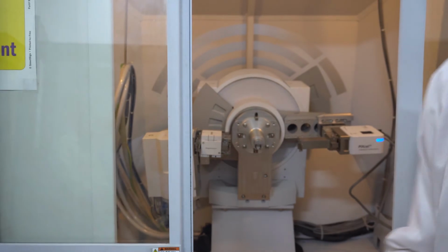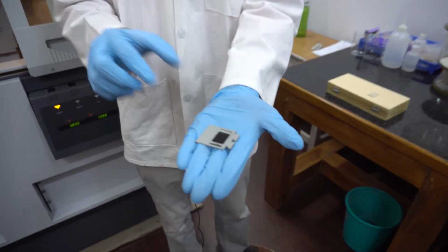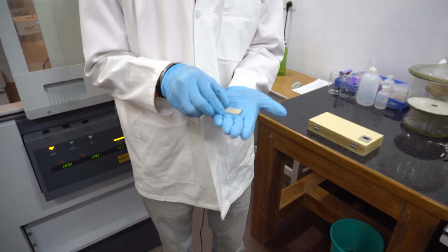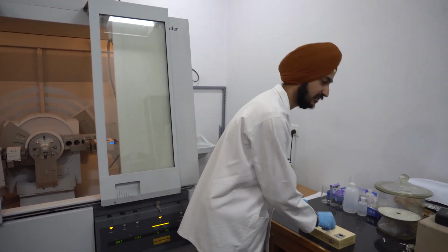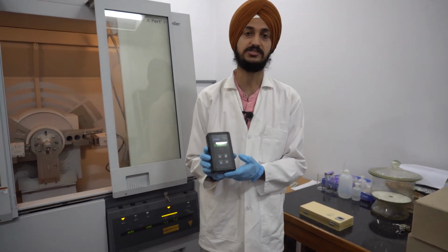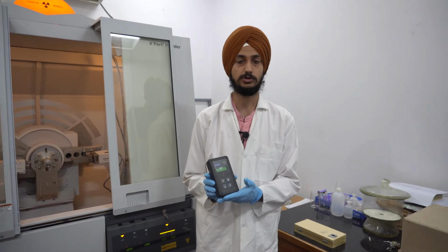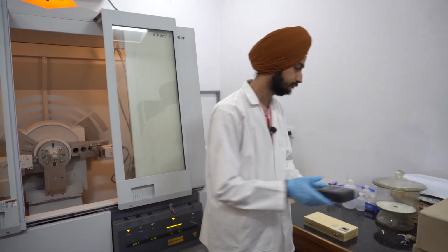There are two types of powder holders which we have. One is for bulk samples and another one is for clay slides. Now I will show you the practical working of the instrument, and how we operate it safely. For safety purposes, we generally use the Mazur counter, which is a GM counter. We check for external radiation so the operator or any person working in the lab feels safe.